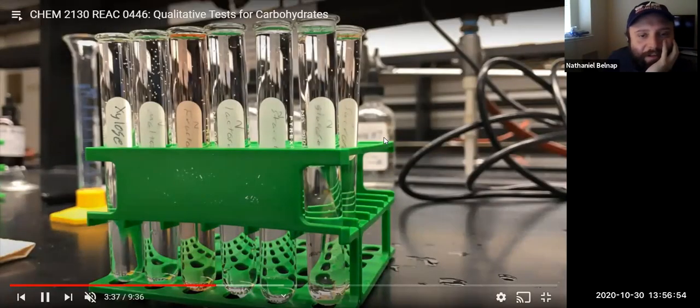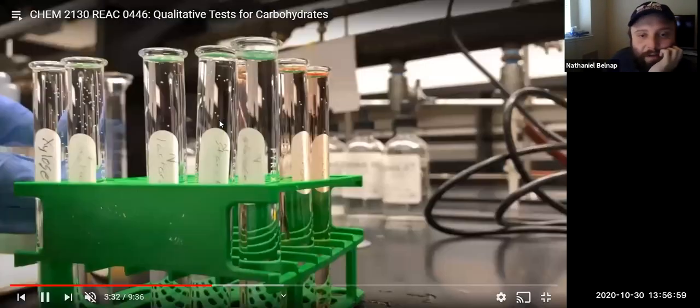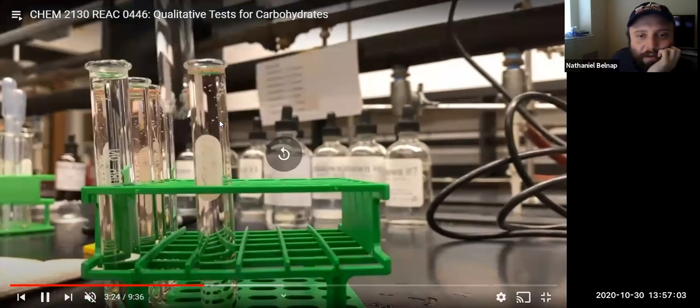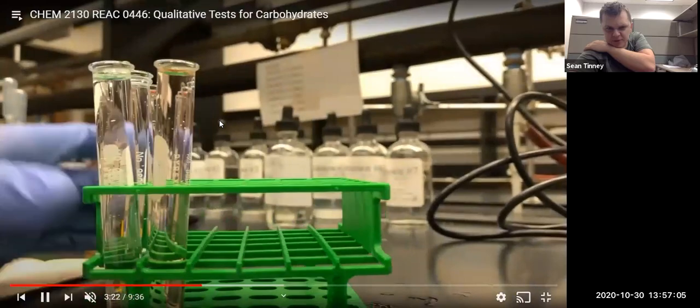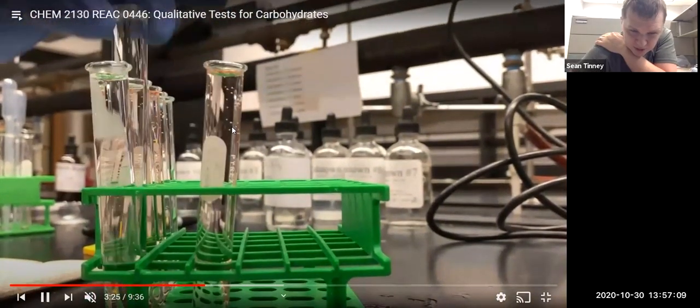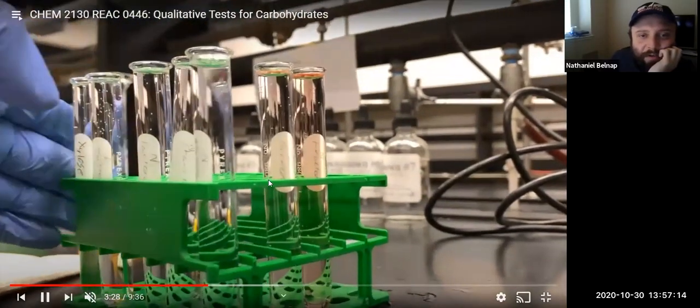These aren't really reacting that strong. So let's go back, because I did not get anything from that at all. So does that mean fructose is the only positive there is, or is there another one? Yeah, it just looks like fructose and maybe sucrose.